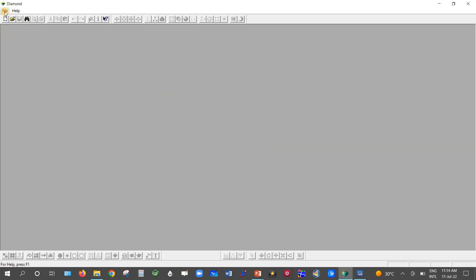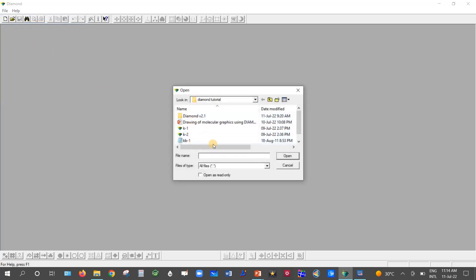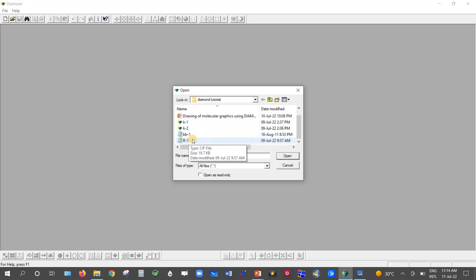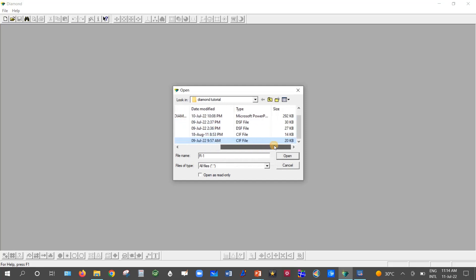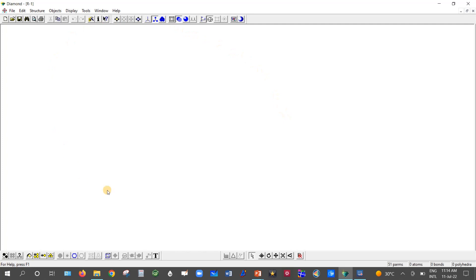Go to File and then Open. You can open either an .INS file, .RES file, or .CIF file — any one will work with the Diamond software. I am going to open the .CIF file named R1, which is a crystallographic information file. Select it and open it. The background color will change from gray to white. You can also choose a black background or any color of your choice.